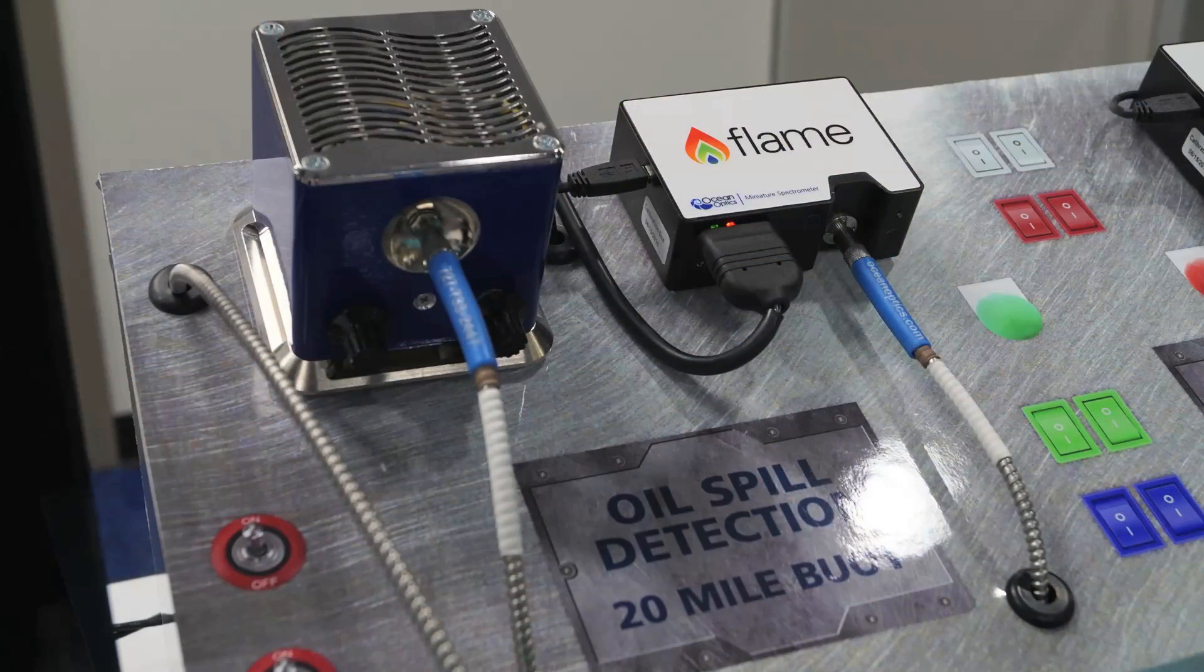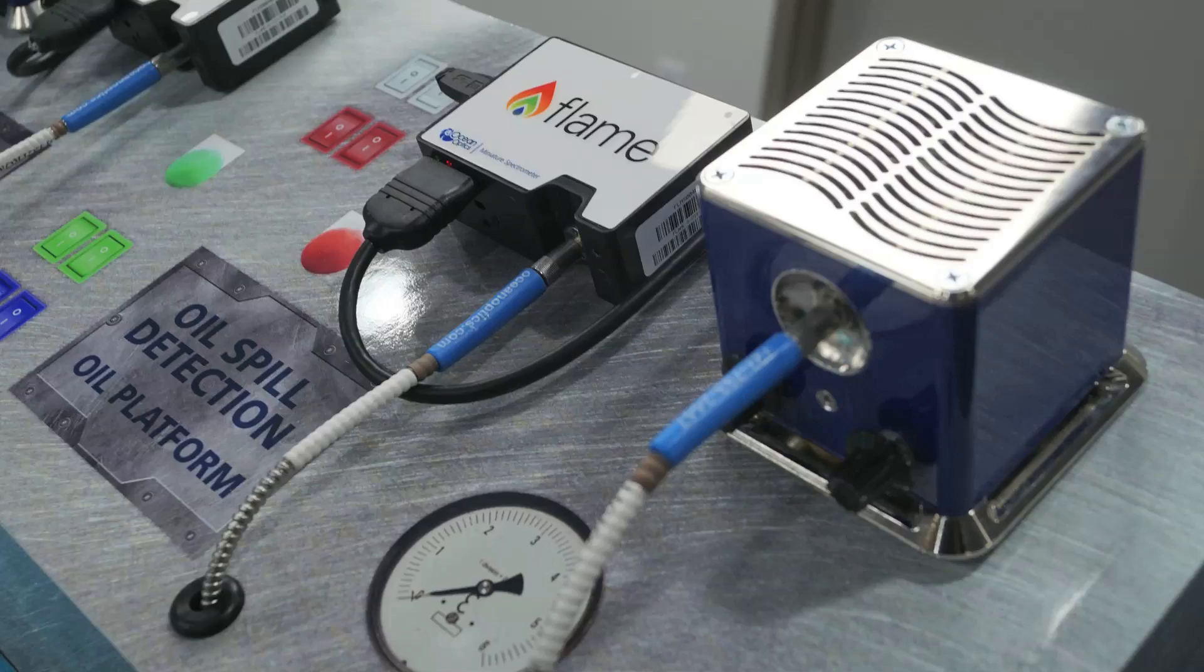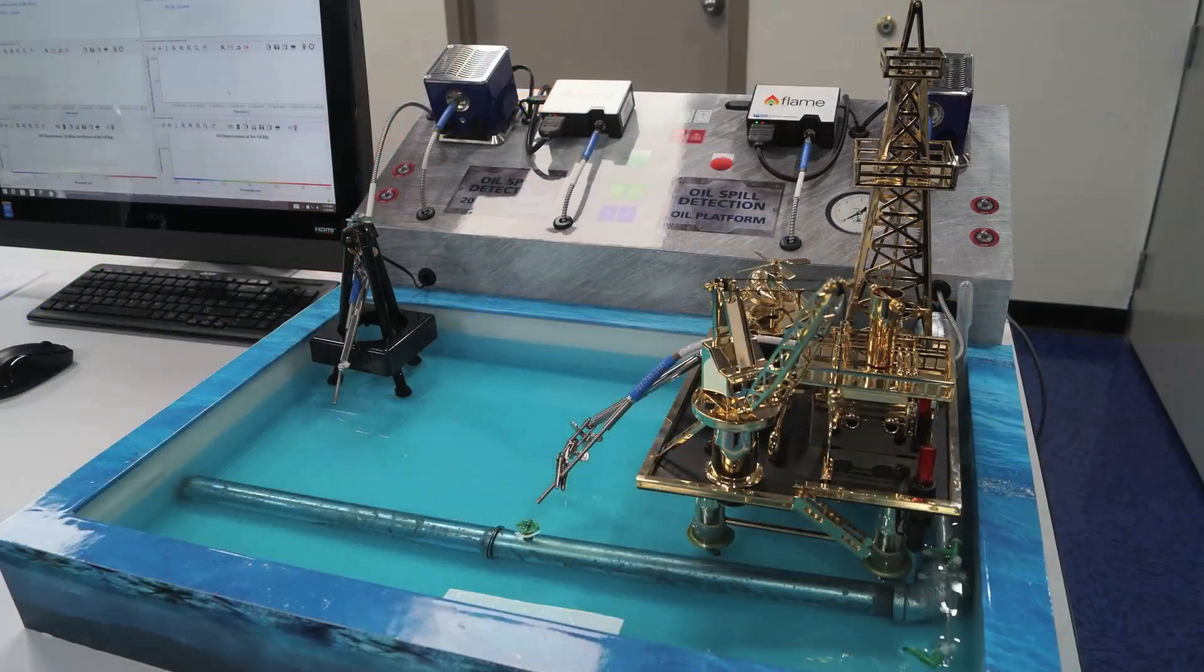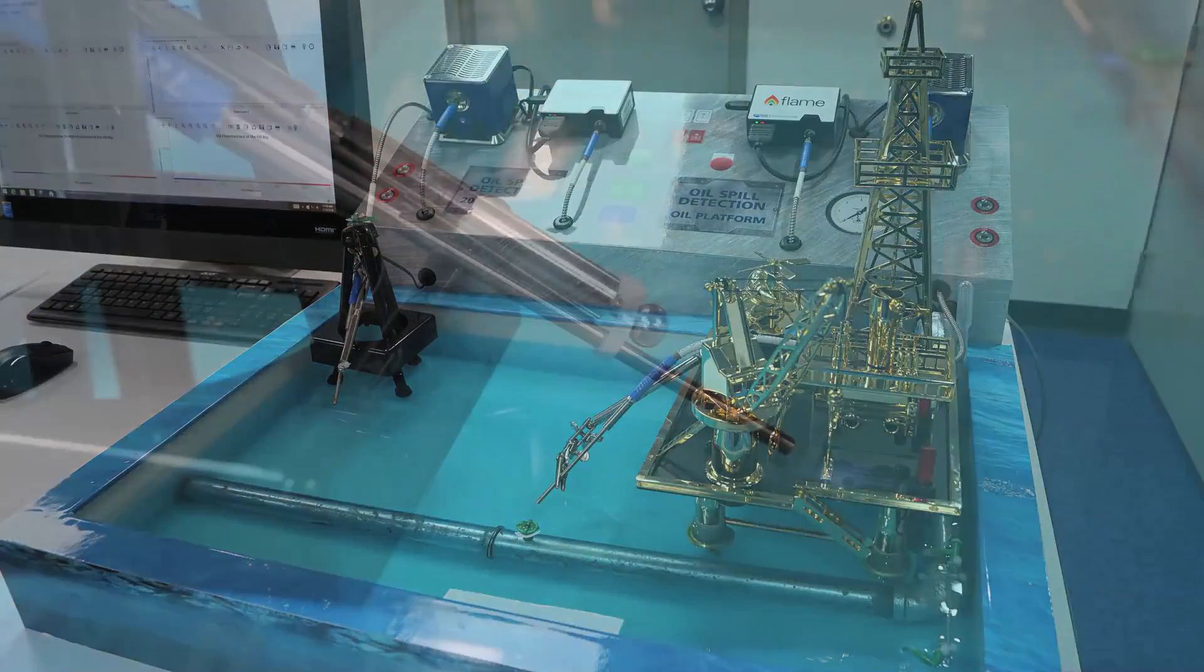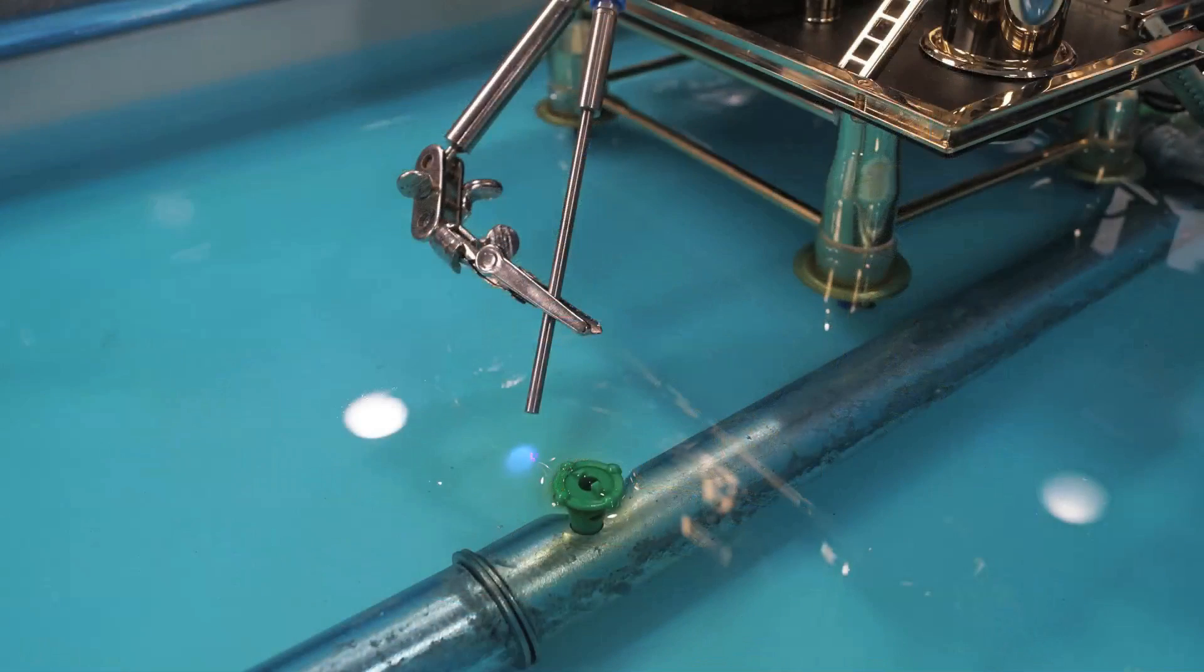Here we're showing our flame spectrometers measuring fluorescence using a 365 nanometer LED for excitation. We have our reflection probes continuously monitoring the surface of the water looking for fluorescence that would be indicative of the presence of oil.